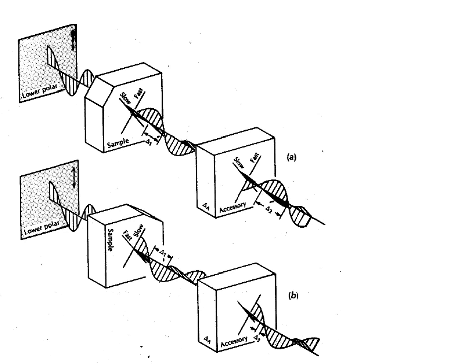The microscope is equipped with an additional plate called the accessory plate. In many of the microscopes we were using in lab, these had been taken out and set aside, but they are available, and there's a hole over the stage where it can be inserted. The plate is not normally inserted all the way, but it can be pushed into the field of view over the microscope stage when you want it there.